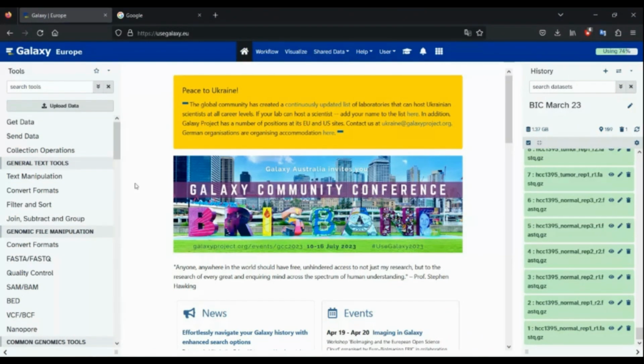Let's jump immediately into uploading the data first, because this will take some time. So I'm just going to do the task first and then explain what I'm doing. Before we do that, I want to make sure everyone is up to date with what I'm doing. I would suggest you write down the things that I'm telling you, though not the entire thing.